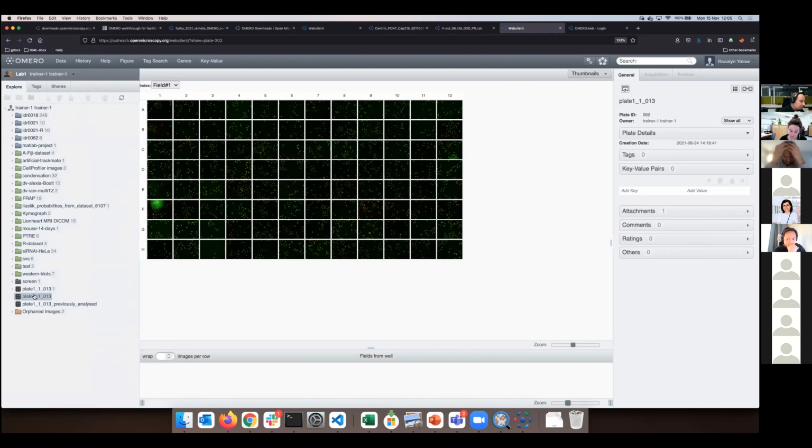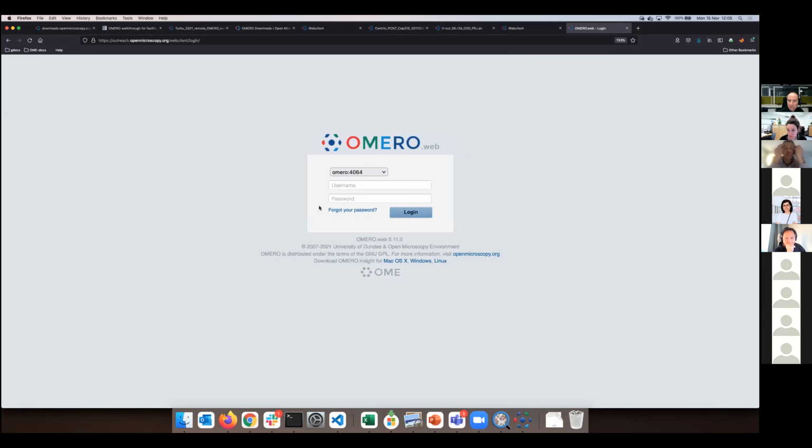And then you can move the duplicate into that public group. Okay, and by virtue of being the public group, the people who are coming from the very outside will be able to go through that barrier of the login without being asked a thing, and then they will navigate to an image in Omero.